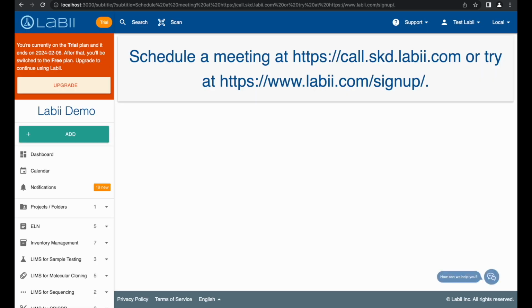That's it for Electronic Lab Notebook in production. I have only covered a fraction of the features of Labii ELN. Please refer to our documentation for a complete guide.